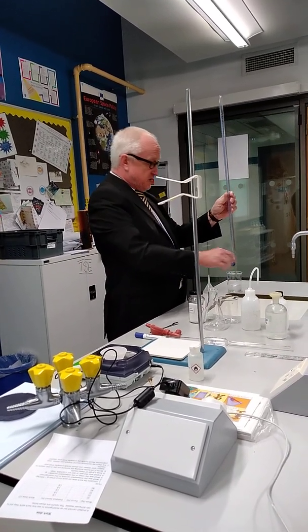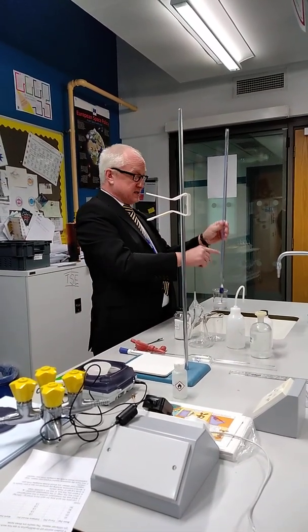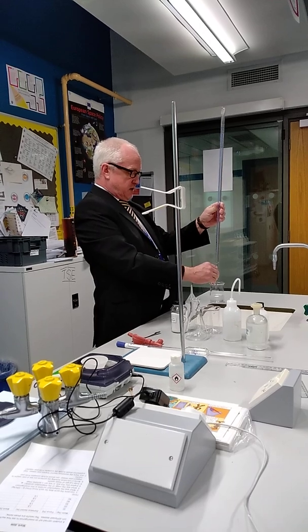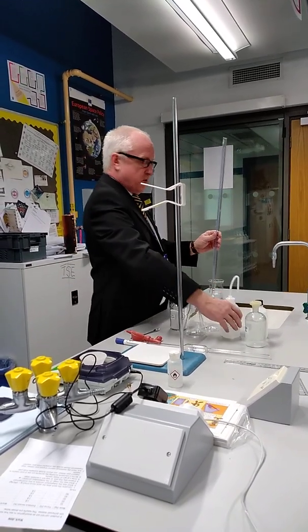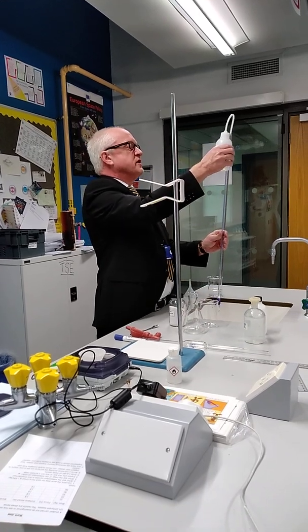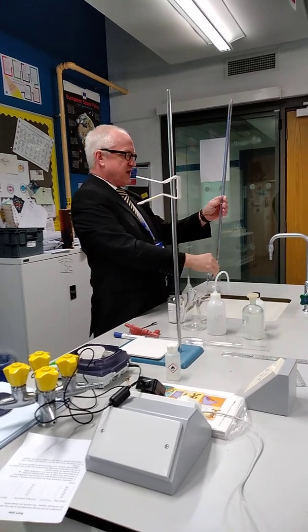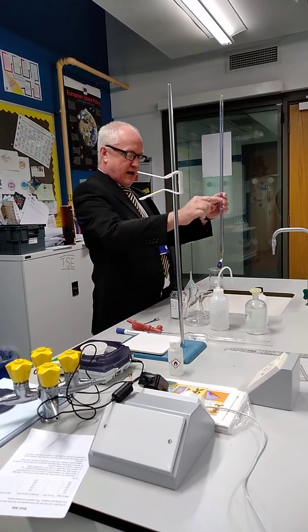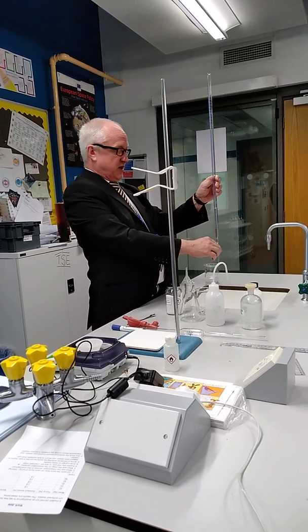The way we're going to do that is take a 25 cubic centimetre aliquot of this and titrate it with sodium hydroxide. We're going to be using the same burette because we haven't got enough burettes, so we're just going to give it a quick rinse out with water first. Once we've rinsed it out with water, we're going to rinse it out with the sodium hydroxide, just the same way as we did before, and then do the titration.